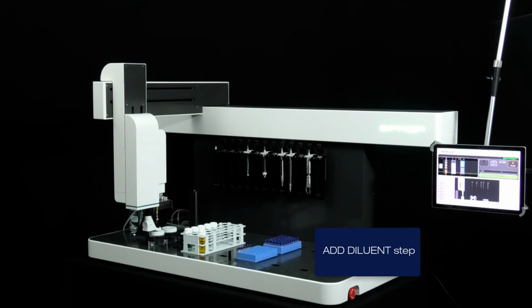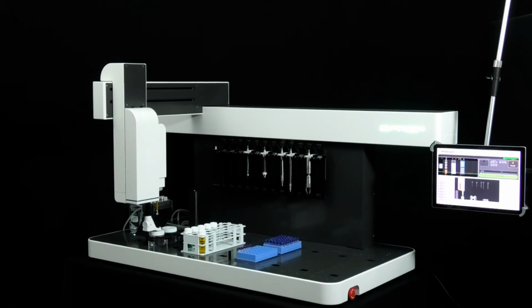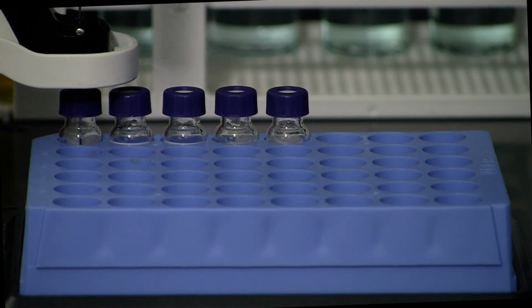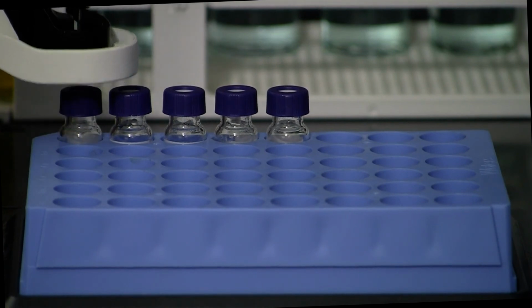The syringe will firstly aspirate solvent from the solvent jars and then dispense into the first 3 vials consecutively. This occurs because we have specified 300 microliters of diluent using a 1000 microliter syringe. So to optimize the workflow, the ePrep automatically works out the best aspirate dispense protocol.